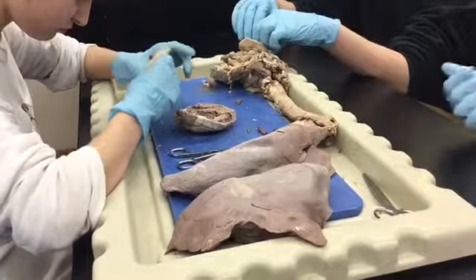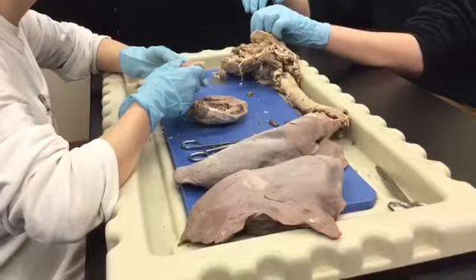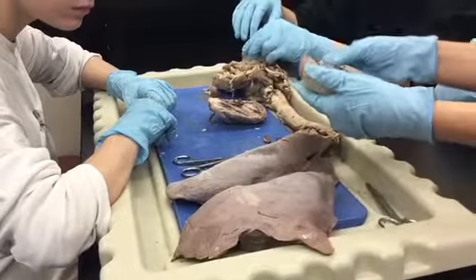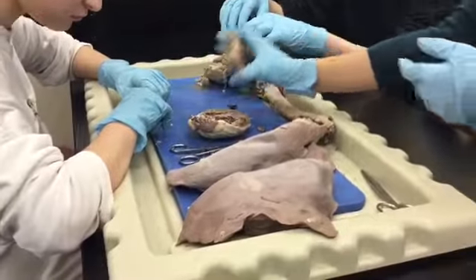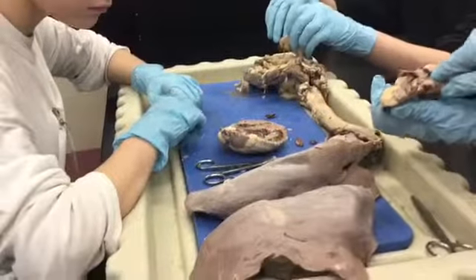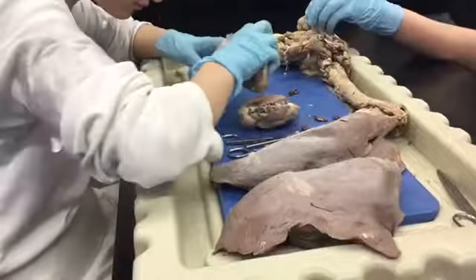Do you know where the inferior and superior vena cava would be? Because the sheep heart is on all fours, the parts that are like this are really hard to see. Oh, so would it be on the outside? It still goes into the heart, but we're not oriented enough with the sheep heart to know exactly where. But in here, that's going to be your aorta. Right in here. And then you have the vein. Mm-hmm. Yeah. Stick your finger right in.